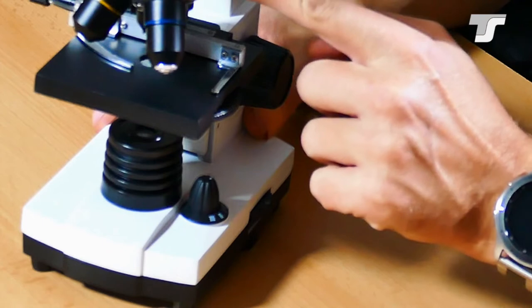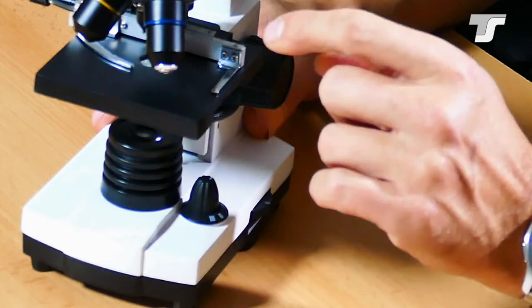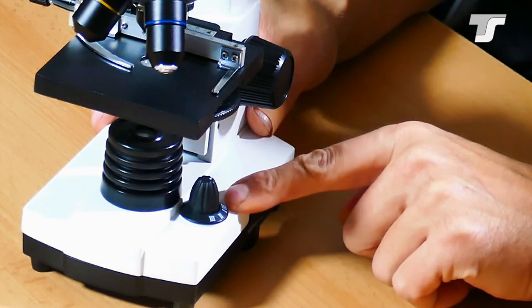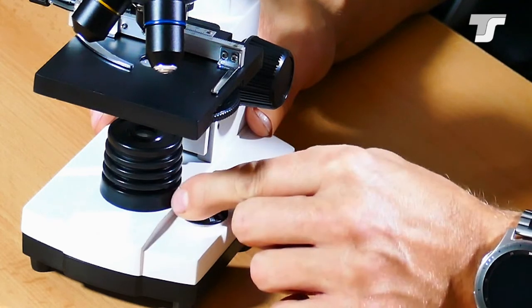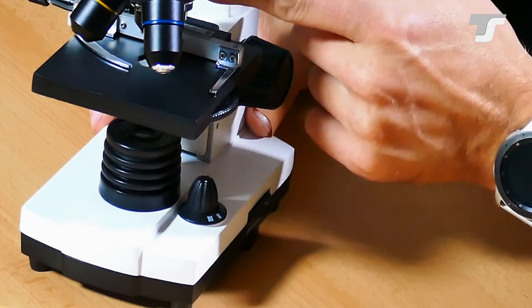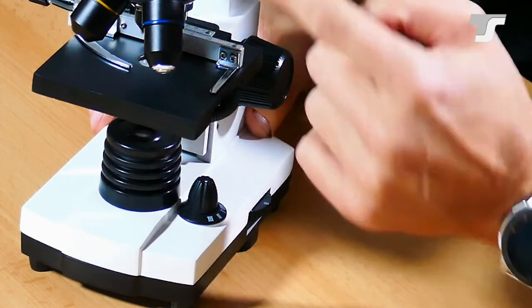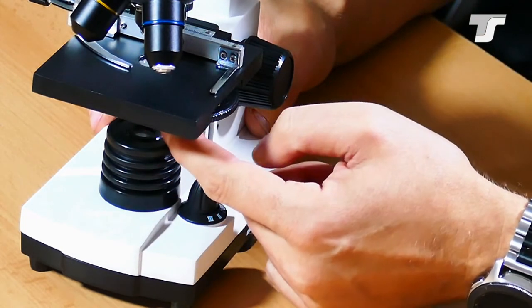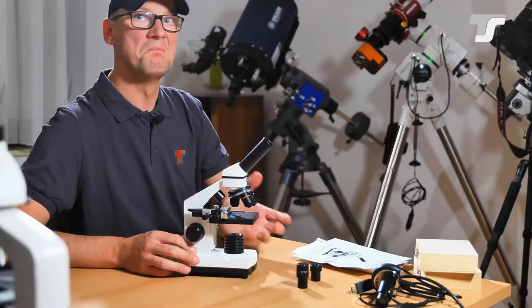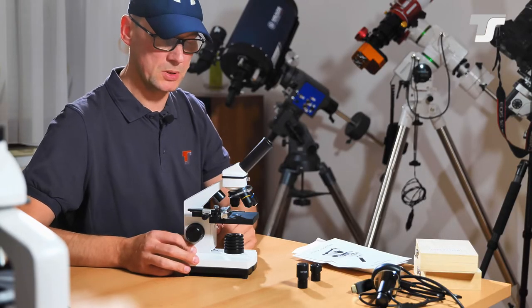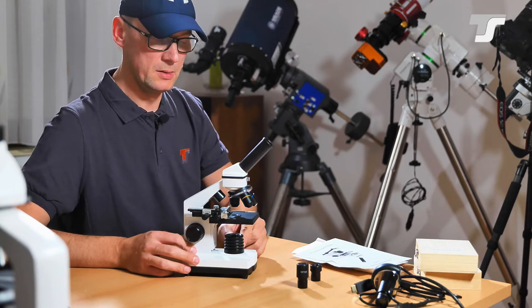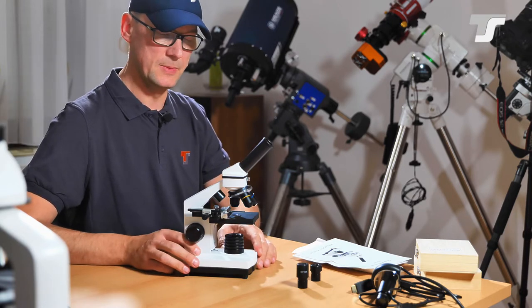And to enable these two lamps, you use this knob here. It has basically four positions: only the top light, the reflecting light, only the transmitting light, or both of them. Maybe sometimes you have an object where you need both. That is possible and you can adjust this here, switch it on and off.